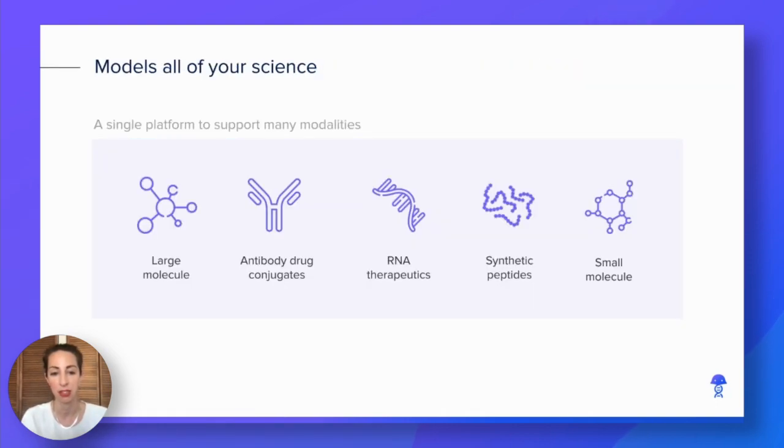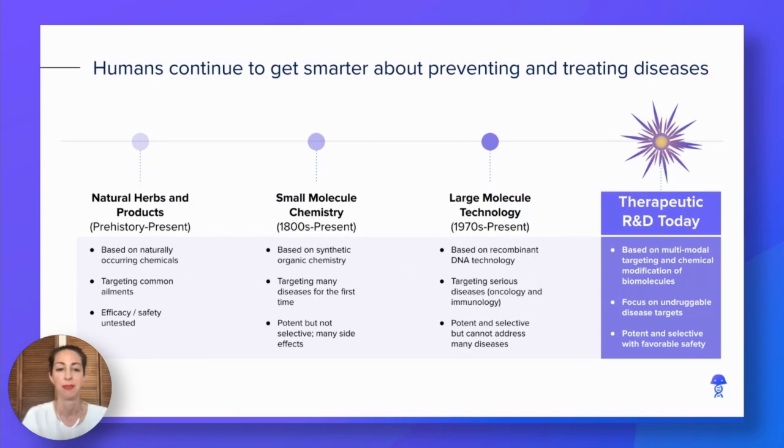The flexible nature of Benchling allows us to continually expand the types of emerging scientific modalities we can natively support with purpose-built capabilities. We're entering a new era of science where there is no longer just a finite number of validated targets. Instead, we see approaches like bispecifics and ADCs that can increase the druggable population of targets. We're able to focus on bringing together biology and chemistry, for example, into an integrated platform, supporting the hybridization of small molecules and biological experiments and assays.